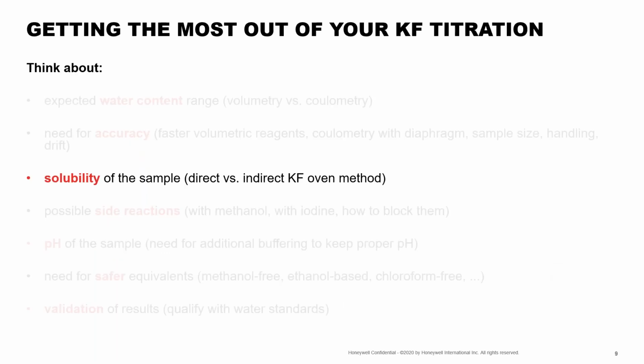Okay, so now that we've covered the two main forms of Karl Fischer titration techniques, let's jump into some other techniques that we can use to get the most out of our titrations by actually tweaking our reagent system. First up, we're going to talk about sample solubility.